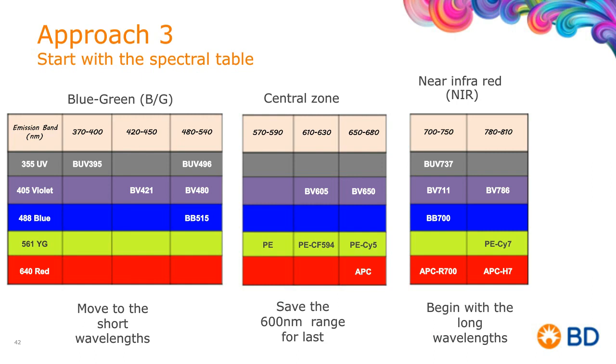So you can see the rationale of all three approaches. They can get you there. The one takeaway here is the fundamentals, if used inside, can always make you a better panel. Now, the approach that you start with is always up to you. And again, there are great panel designers out there in different companies and different universities, pharmas, and biotech, but they probably do use some of those fundamentals to get to a great panel.